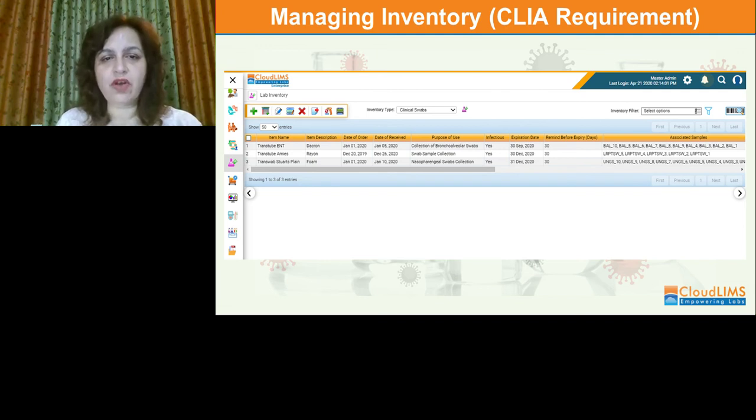Running out of even one of such items can dramatically bring down the number of tests that can be conducted on any given day. A LIMS enables you to keep track of inventory. For those running low, it sends an alert to the lab manager so that they can quickly take stock and place an order. Since the lead times are higher than usual in these unprecedented times, it is advisable to keep the thresholds higher so that your stocks are replenished even before you run out of them.